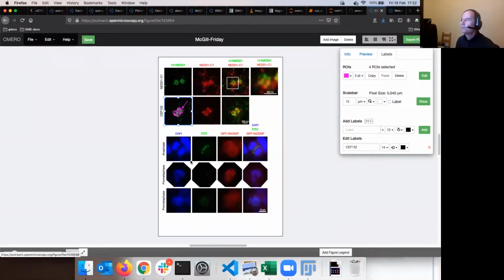So let me say, okay, the crucial point, of course, is where will that be? Where will the letter be? I can say it can be on the top, that's fine, as these labels are. Or it can be inside those images, that's fine too. But if you want a completely free-floating label saying B here, and a completely free-floating label saying A, which is completely detached from any of those panels, then we would have a little bit of a problem.